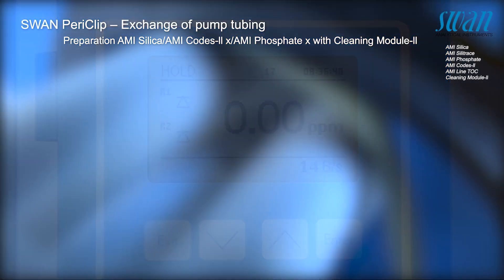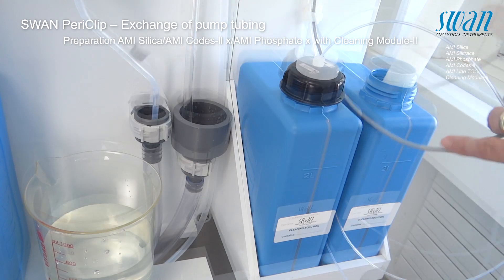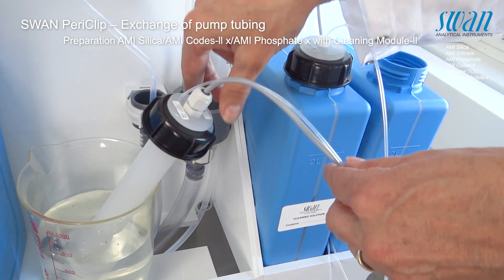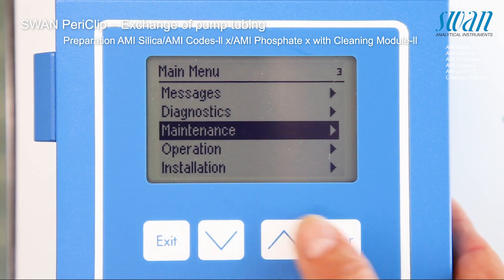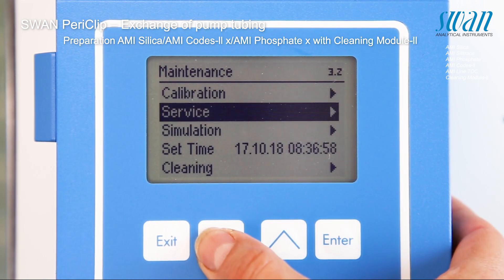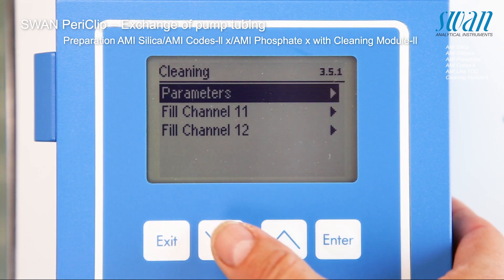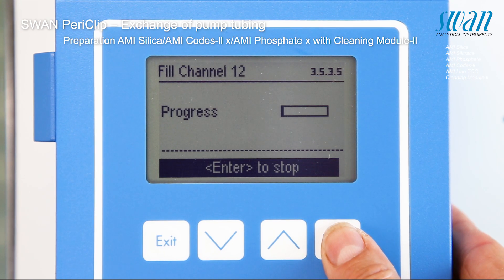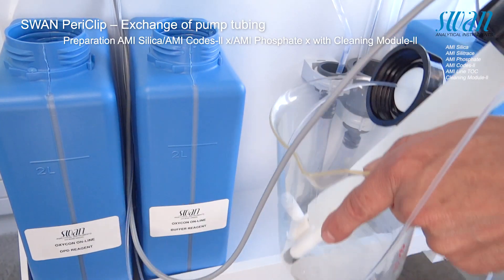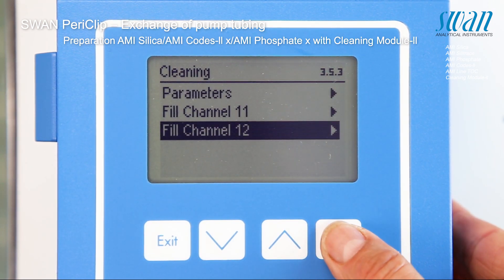If there is a cleaning module installed, continue with the following procedure. Place the suction lances of container 2 in the bucket with demineralized water. After the pump has stopped, place the suction lances in an empty bucket and repeat the fill system to empty the tubes.